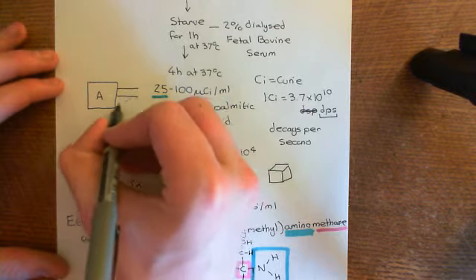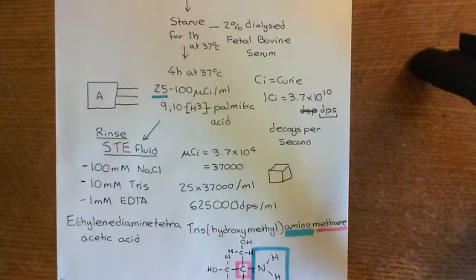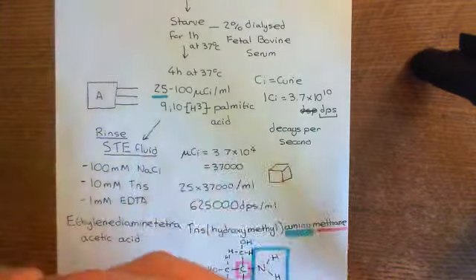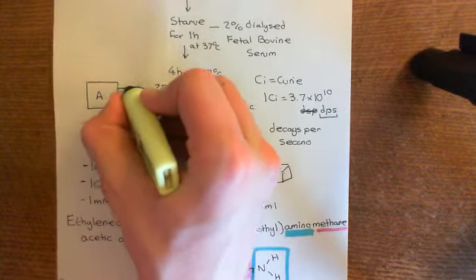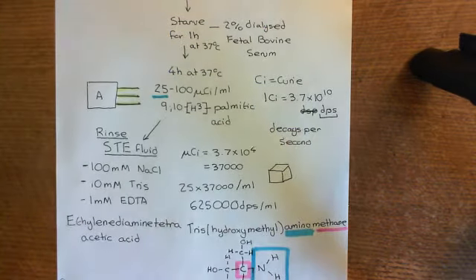So I'll just show, let's say it gets 3 of them added onto it, and I'll put these in the best radioactive colour that I have, which is that. Yellow would probably be the best colour, but I'm not sure this will show up. So these are radioactive palmitic acid molecules. They have 2 tritium atoms in, remember.